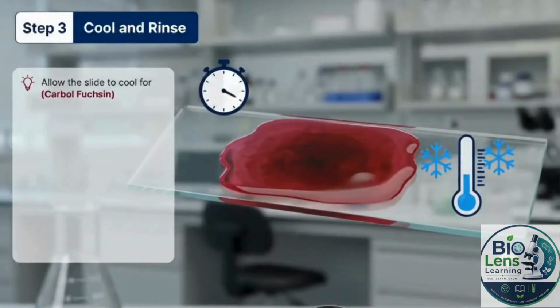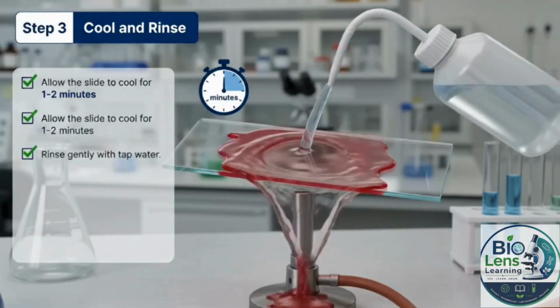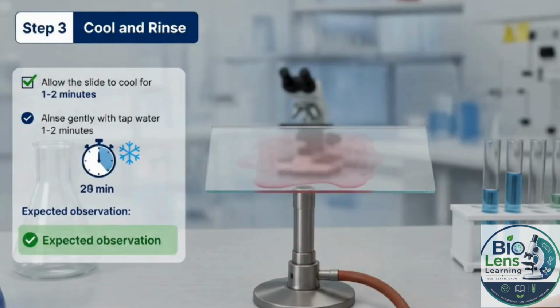Step 3. Cool and rinse. Allow the slide to cool. Rinse gently with tap water. The slide now appears lighter.